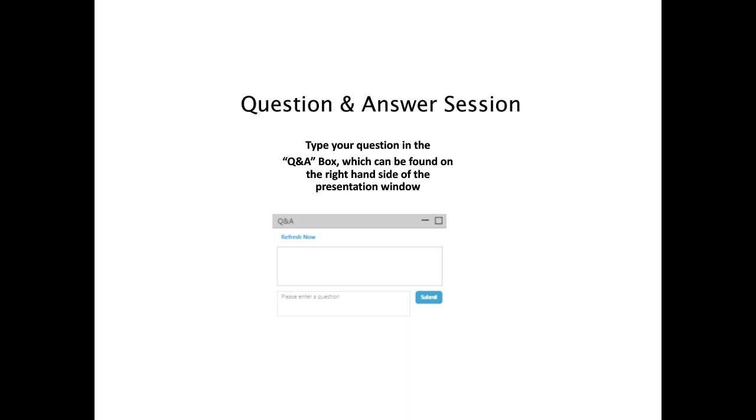Here's another question. Do you recommend using the Micro-Viscometer alone for QC and process monitoring applications instead of including light scattering? Yeah, I'll take that. We're not specifically recommending that we use the Micro-Viscometer alone, but it can be advantageous in that it's not as sensitive to things like contaminants such as dust or other large particles, as light scattering is. So it could be used for QC of samples that may be a little more dirty, or if you don't want to take the time to process or clean the samples.